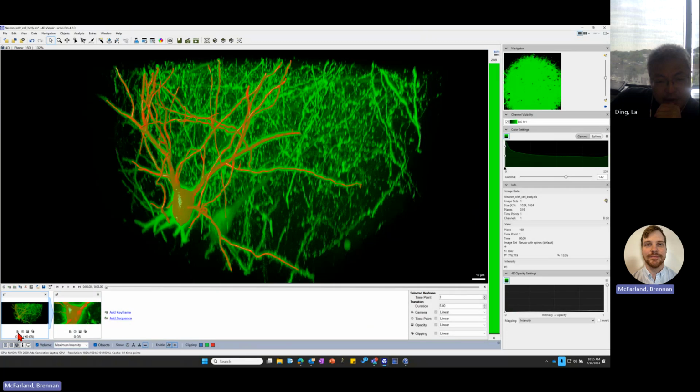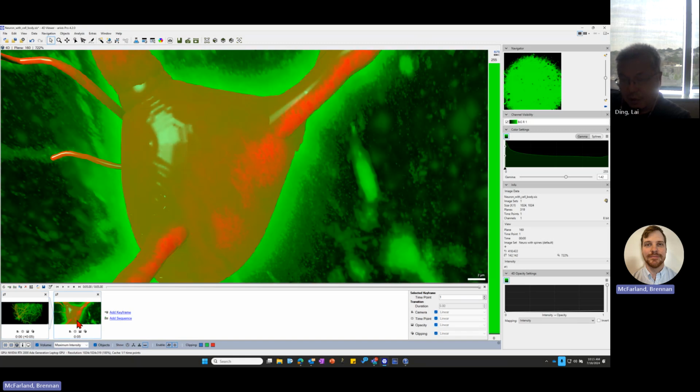There are a couple of options that you see over here on the right. You can pick the duration of these, the time that it takes to go from this point to this point. You can see it says it takes 5 seconds. So starting at time point 0, this transition from this point to this point is going to take 5 seconds. And that's why you see here that this point is going to start at the 5-second mark. We can change this duration either through each of these keyframes, or we can pick up here. There's this option to adjust the target time of the entire movie.